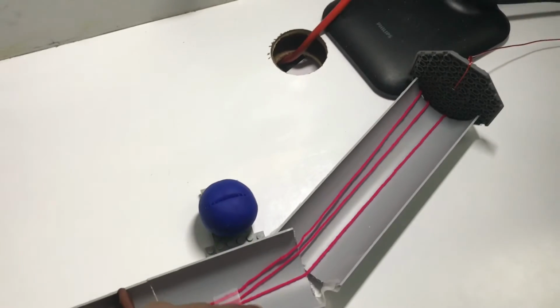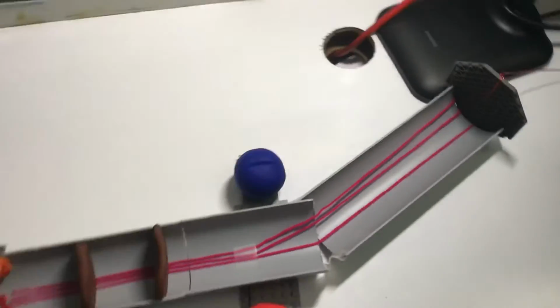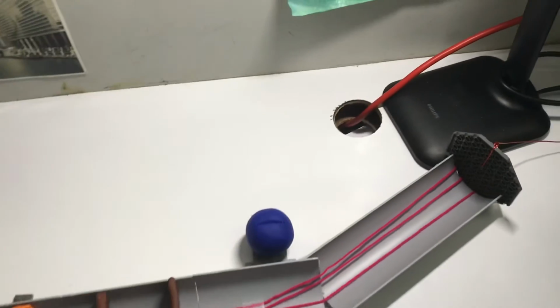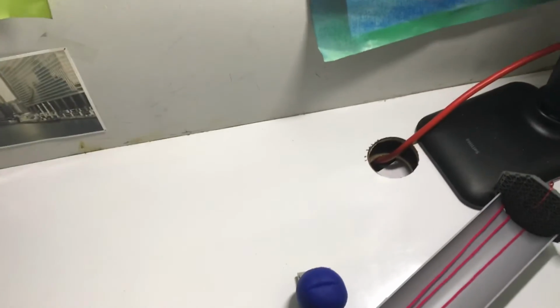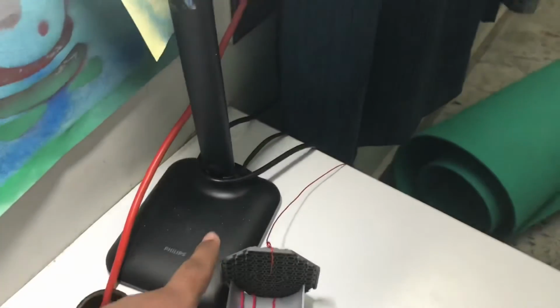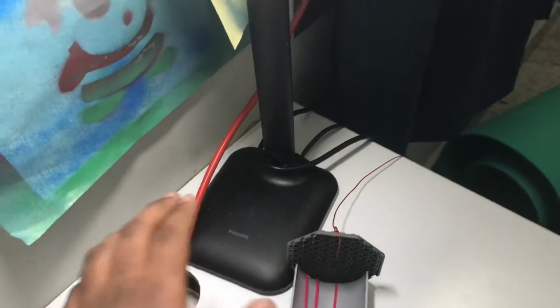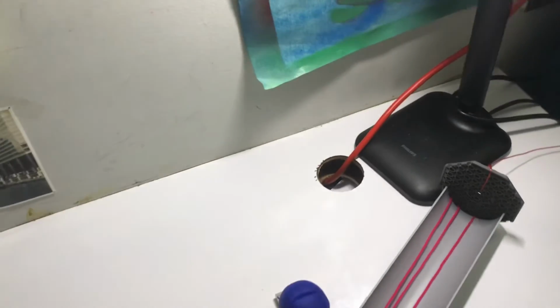This one, the one that is going completely straight in a regular trajectory, is an ion that has a higher mass, a higher weight. And in the situation where there's a higher weight or higher mass, it can either deflect very little, or it could not deflect at all and just go on with its current trajectory. And they travel until they hit this thing, which is a detector. And that brings us to the last step of the mass spectrometer process.